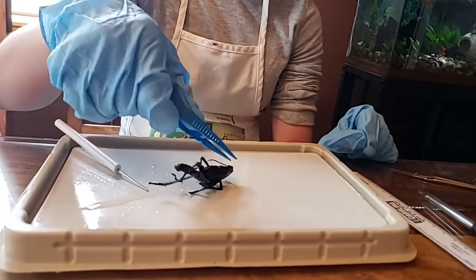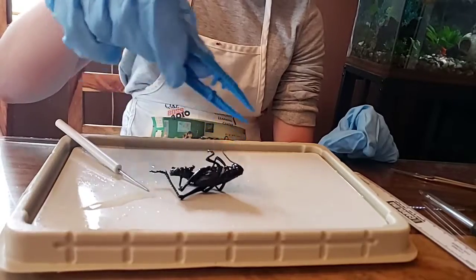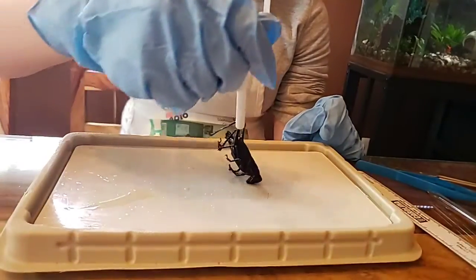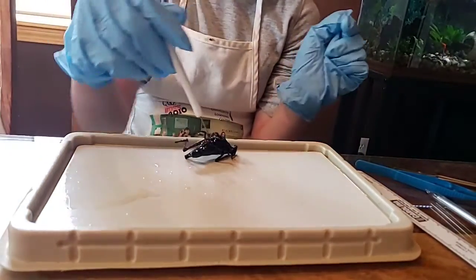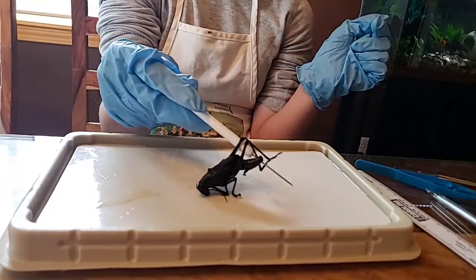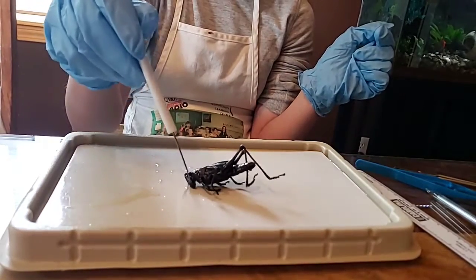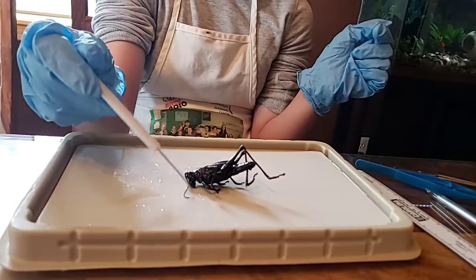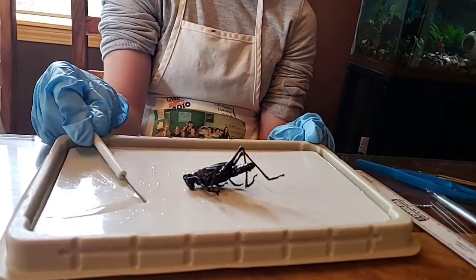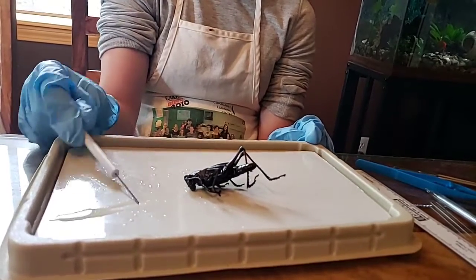All right, so grasshoppers have 2 compound eyes and 3 simple eyes, or ocelli, located between them. The simple eyes do not form images, but do sense light. Then there's 1 pair of antennae. Do you see the 1 pair of antennae? Yeah. How many pairs of antennae did the crayfish have? 2 sets of 2, or 4 total. 4 antennae. Okay.